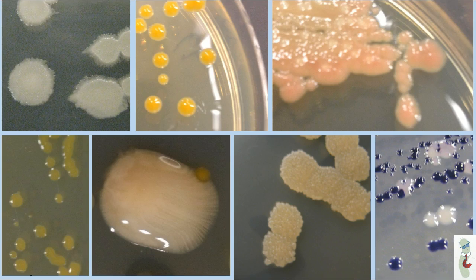Here's a few more colonies that I've come across in the lab. These colonies came from water samples. These colonies have different colors and textures. The drier colonies, the ones that have less water content, are less shiny, while the moist ones are shinier and can appear almost mucoid-like.